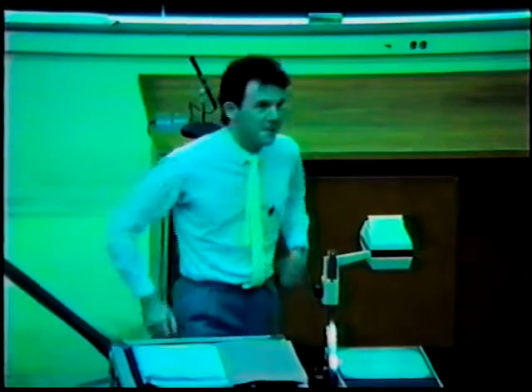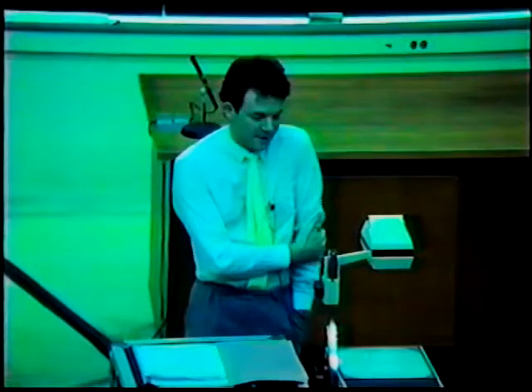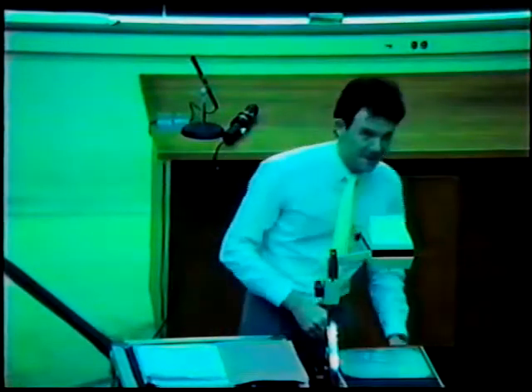So my talk is in three parts. First, I'll say a little bit about how the NMR diffusion experiment works. Then I'll say a little bit about the description of the particular zeolite system we've looked at, and then talk about the NMR results at the end. So if I have my first slide, please.